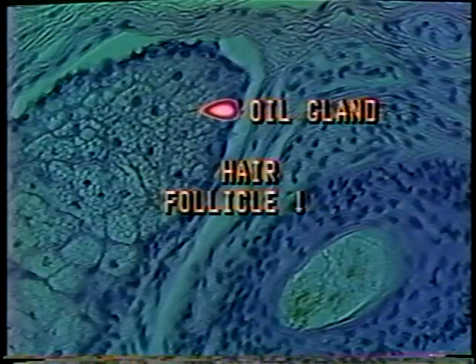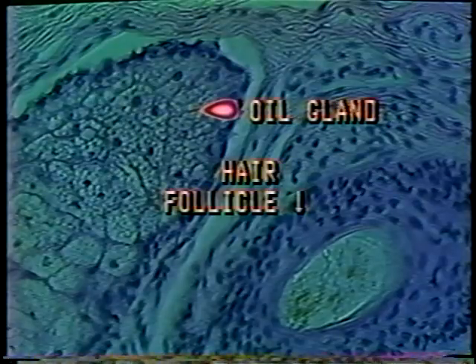The oil or sebaceous gland is a larger, solid-appearing gland often located near the hair follicle, and its ducts secrete their product into the hair follicle. The fatty or oily product gives these cells their whitish appearance. Hair and hair follicles can best be examined by studying a slide of the scalp. The hair follicle is composed of epidermal cells that extend into the dermis in a tube-like structure.